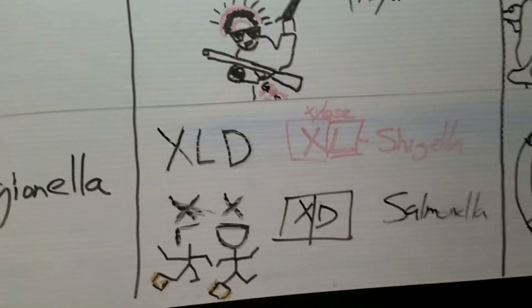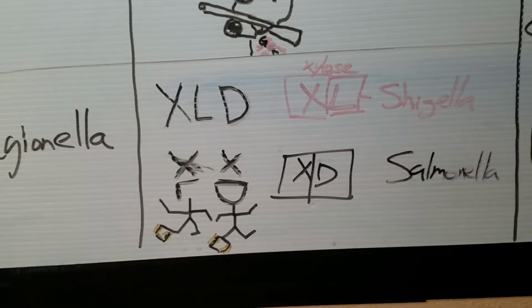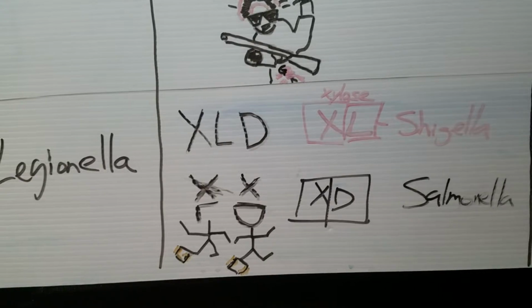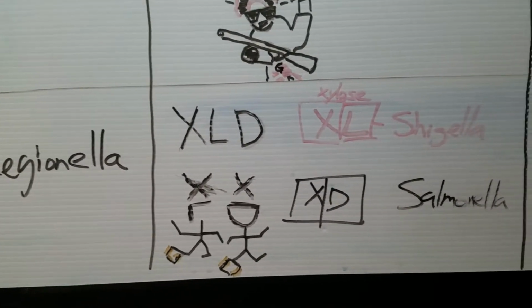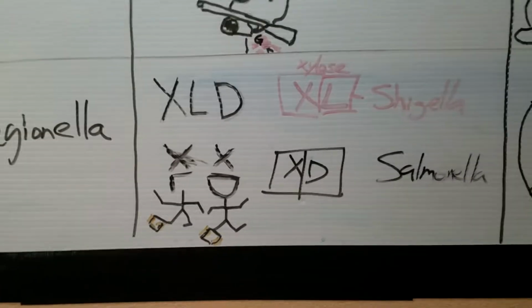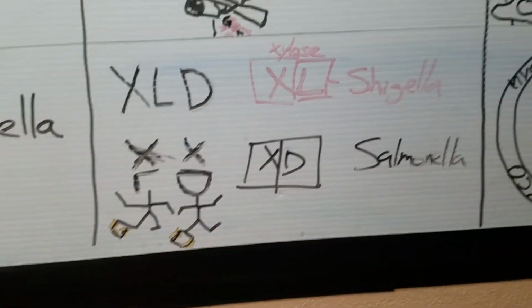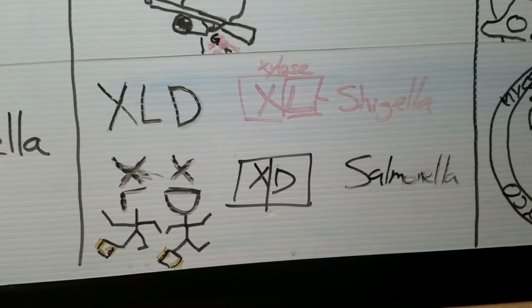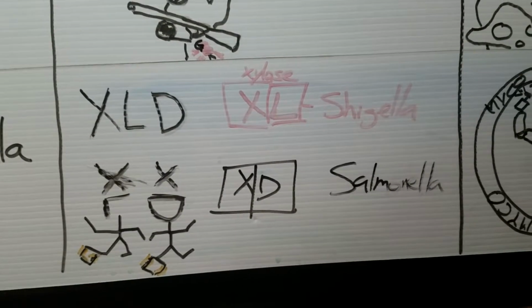All right. XLD. This is an odd name for an agar plate, but it's there, so let's take a look. XLD, when I turn it to the side, I can turn it into emoticons. You see over here XL, XD, and it becomes these dancing guys who are stomping on these graham crackers. That means, once again, it is inhibiting the growth of the gram-positive organisms.